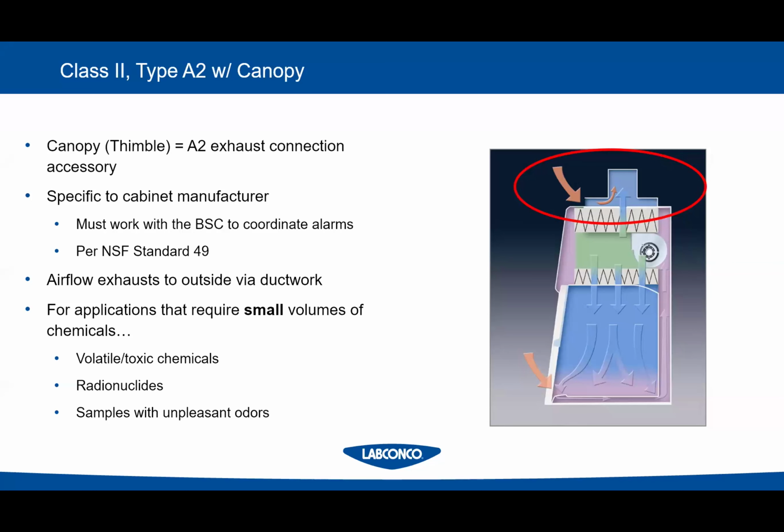Okay. A2 style cabinets also have this kind of recirculation loop in them. All the air that comes in is not going out the top. Some of it gets passed back through and is in this loop, right? So if I have something that's flammable, one of the things to consider is your amount. Is it possible you could reach your lower explosive limit? It just depends on your volume and what's happening there. So these are all risk assessment things that have to be considered.